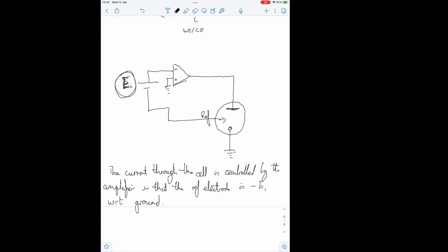So if there is something wrong with your ground circuit in your lab, that is going to affect your measurements. There are several ways to make something wrong with your ground circuit. If you're designing an electrochemical lab, you really want two main circuits: one that you plug your potentiostat in, and one that you plug particularly any vacuum pumps in.